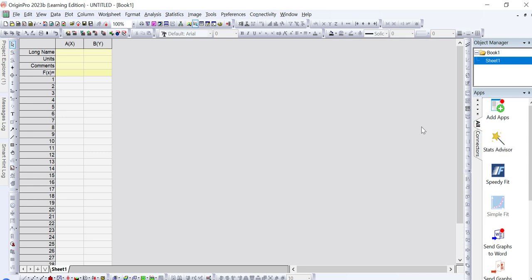Hello friends, hope you are all doing well. In today's video we will discuss how to plot an FTIR graph in OriginPro software when you have to plot two different kinds of processes. For example, if you are studying any kind of adsorption process, you need to plot a graph having two lines.